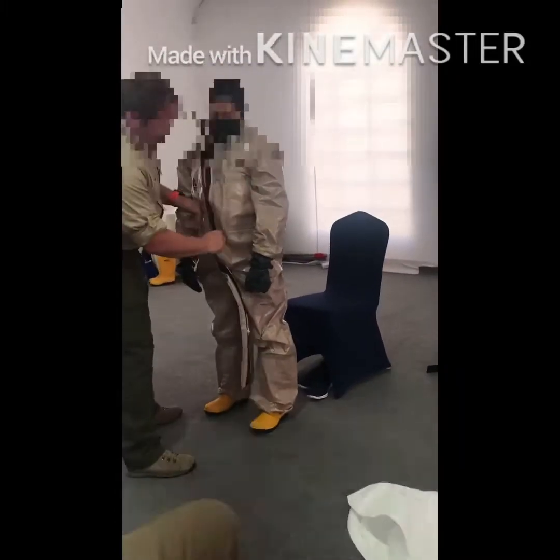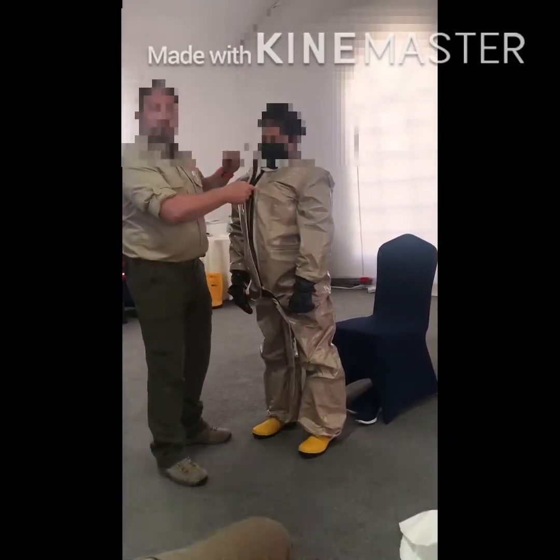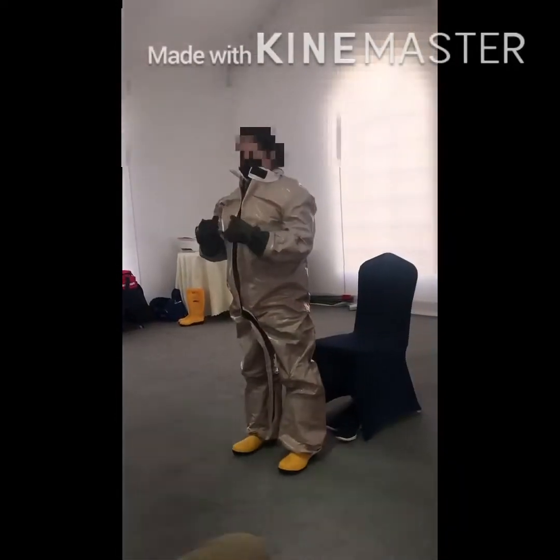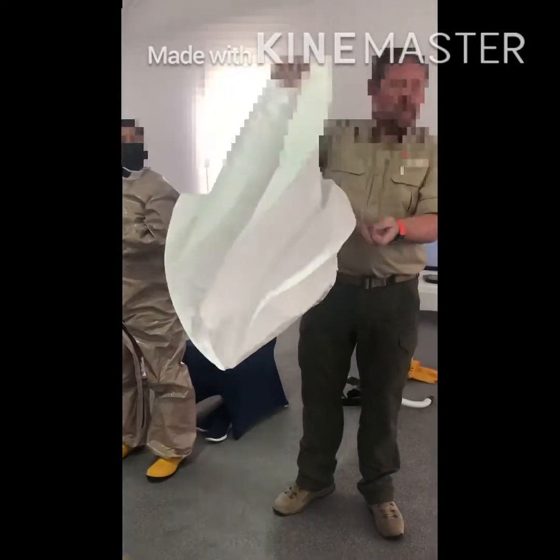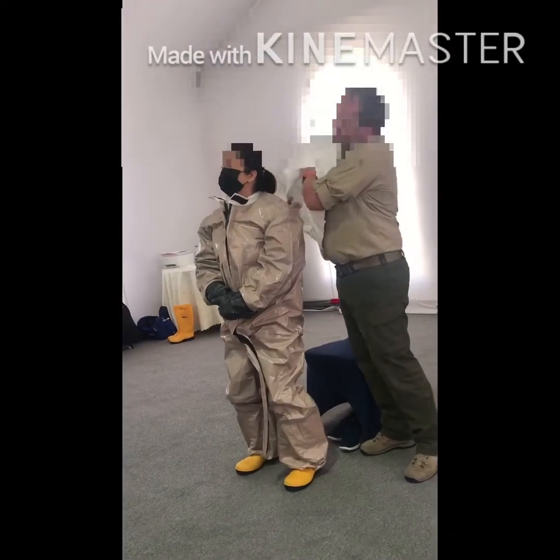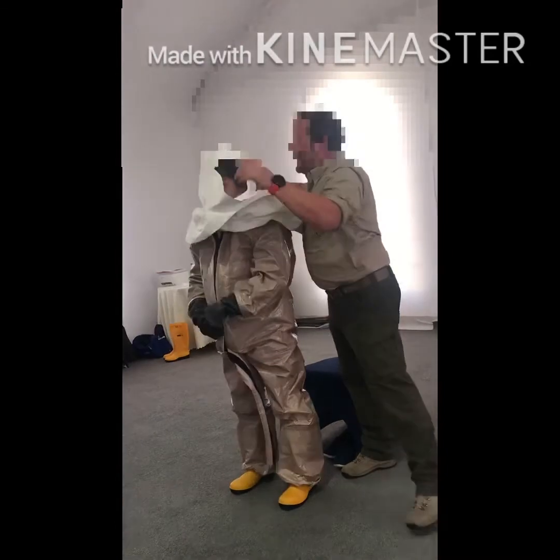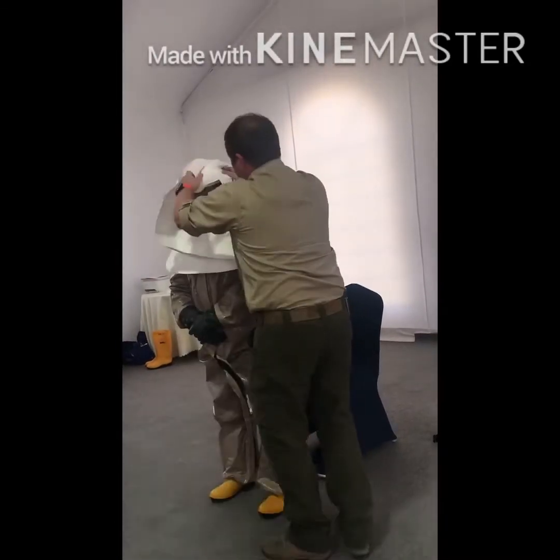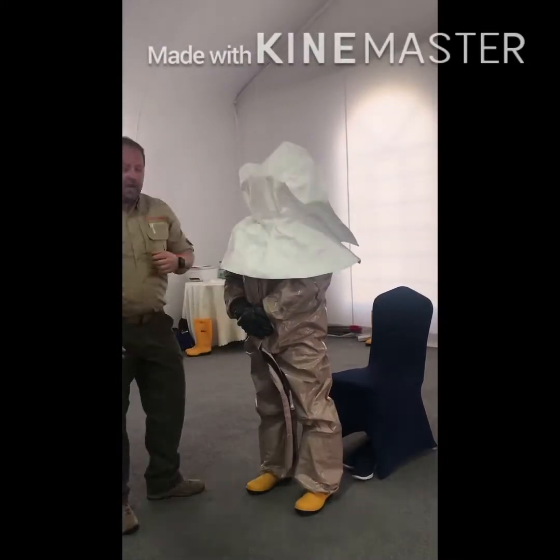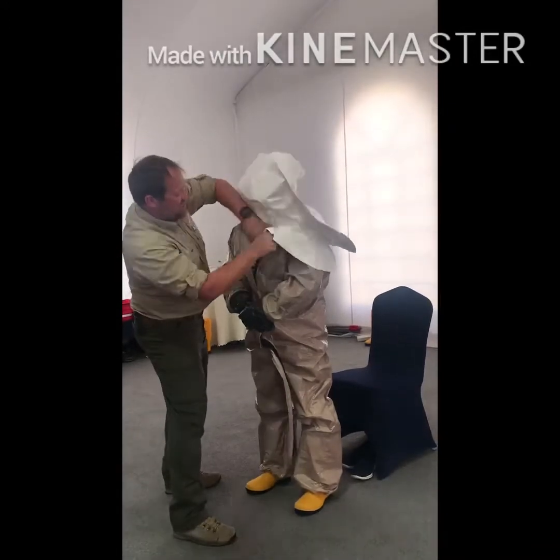Next thing I'm going to do is zip it, but not all the way to the top, to about that, and leave this part open. The cape has two parts, an inner and an outer. I'm now going to get her to put it over her head and make sure that the headband is around the head. I'm not going to take your face mask off because it'll become very uncomfortable. I'm then going to cover up her lovely little face. I do apologise now if I touch anything I shouldn't. This goes inside the suit.